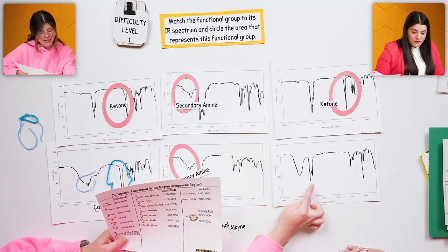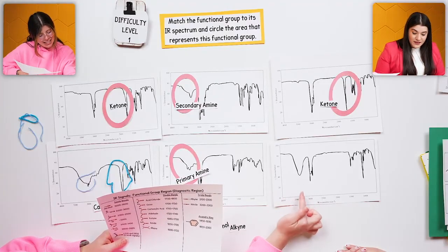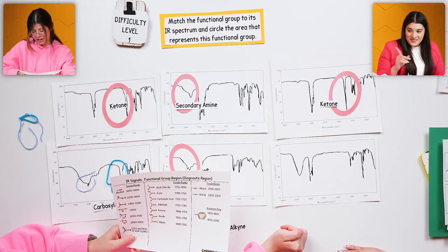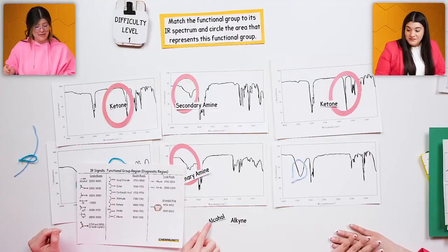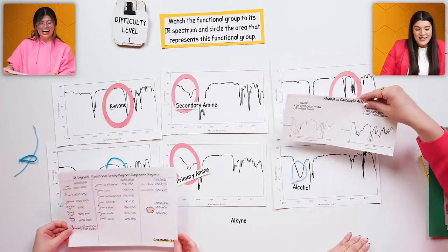Okay, so this little area right here, this peak, is high. So it's like the alcohol region. It has an OH bond. Let's circle it. And what's left? And then, so alcohol? It is. Yeah, you're right. There's no trick here. No trick, and that's exactly what we saw.